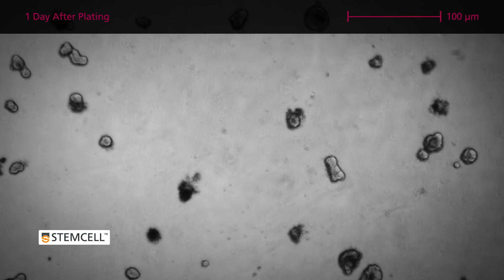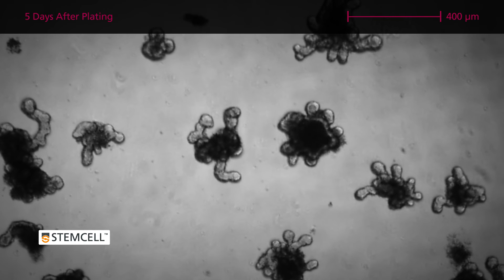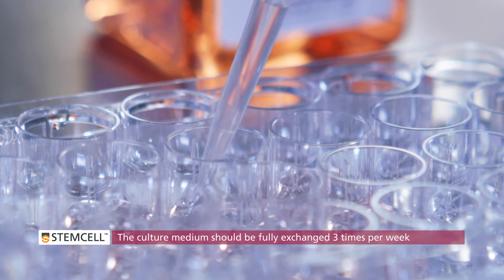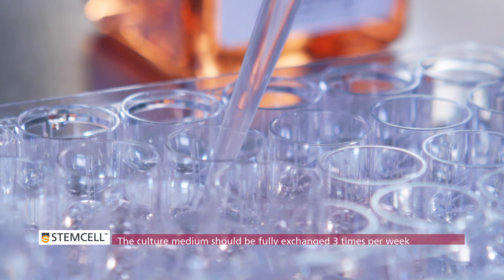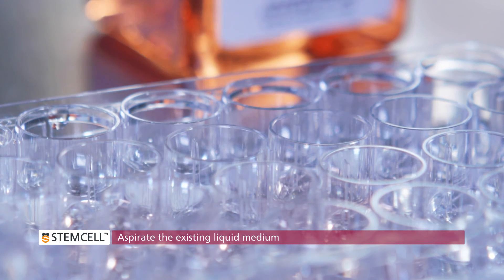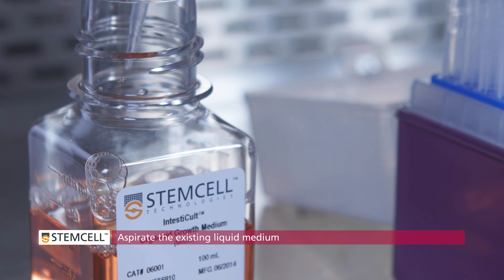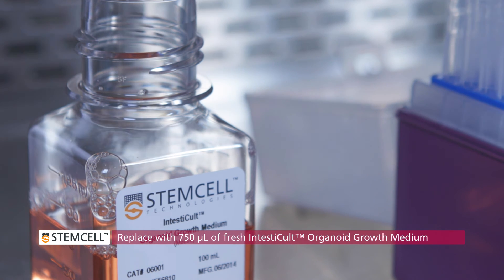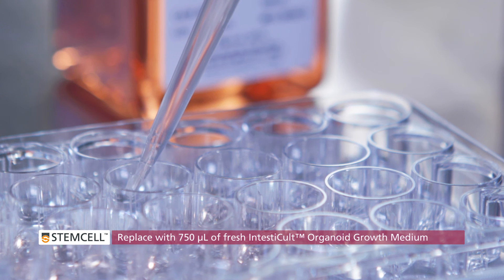Organoids begin to bud after two to four days in culture. The culture medium should be fully exchanged three times per week. Aspirate the existing liquid medium, keeping the pipette tip at the edge of the well bottom. Replace with 750 microliters of fresh, room temperature intesticult organoid growth medium.